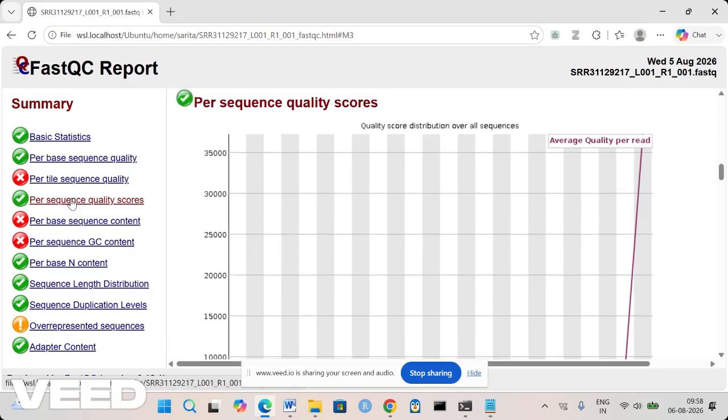Today we learned what NCBI is, what the SRA database is, how to search and understand a sequencing dataset, how to download raw sequencing data using ENA, what a FASTQ file is, why every sequencing read has four lines, what a quality score is, what a Phred quality score is, and how to generate a FastQC report. These are the first practical steps in every NGS bioinformatics project.